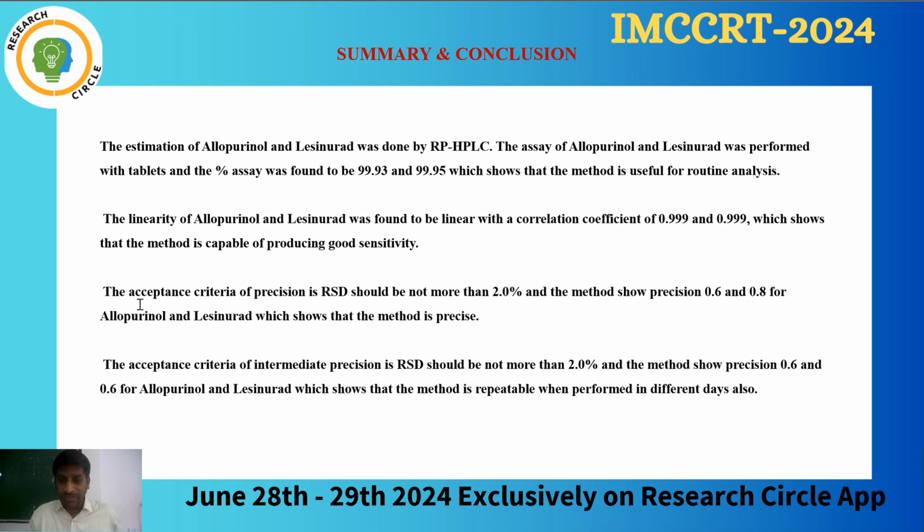The acceptance criteria of precision is RSD should not be more than 2, and the method shows precision of 0.6 and 0.8 for allopurinol and Lesinurad, which shows the method is precise. The acceptance criteria of intermediate precision is RSD should not be more than 2, and the method shows precision of 0.6 and 0.6 for allopurinol and Lesinurad, which shows the method is repeatable and reproducible when performed on different days also.